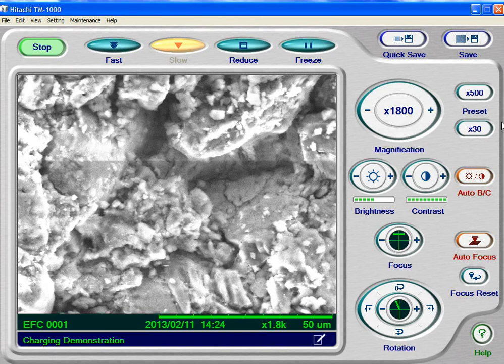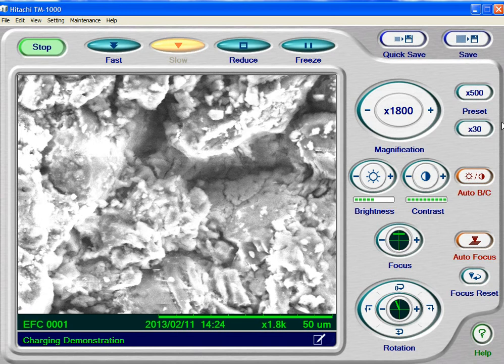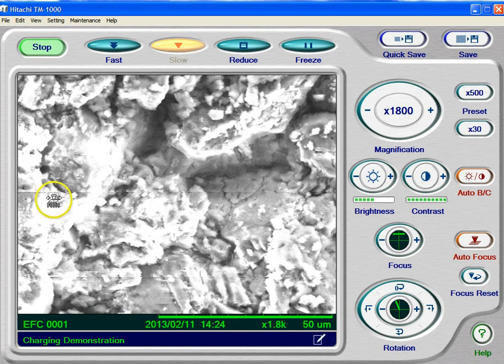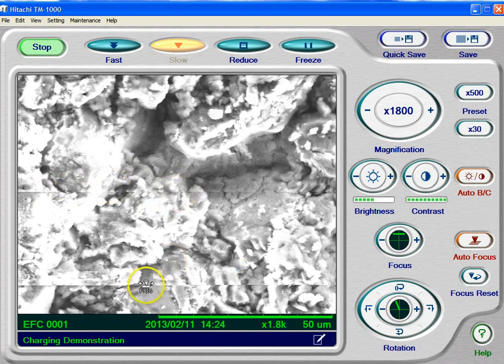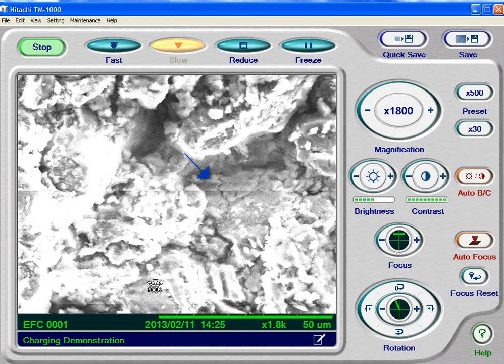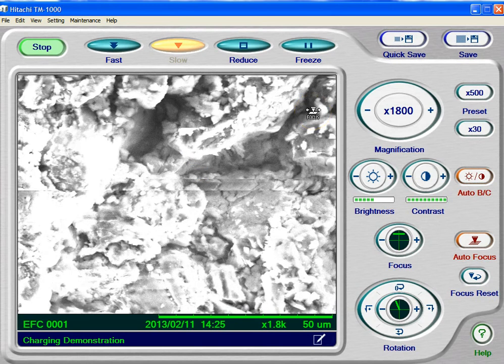So, we're going to let this charge for a second. The other thing that will happen with charging — and it's starting to happen right here — is that as the beam passes, sometimes the specimen will discharge. Right in this area right here, you can see we've got some skipped lines. That's where the specimen built up a charge and that charge left, causing the detector to skip.